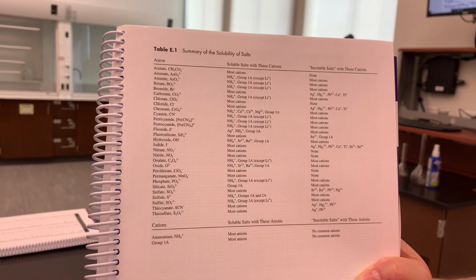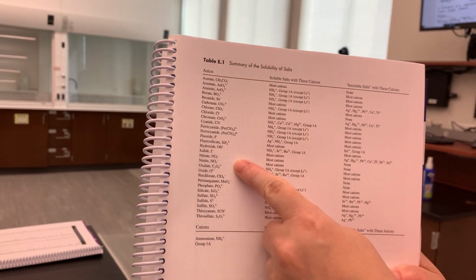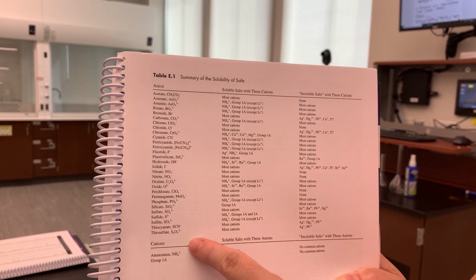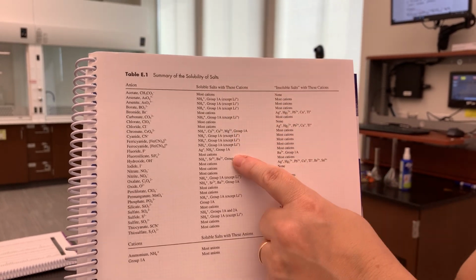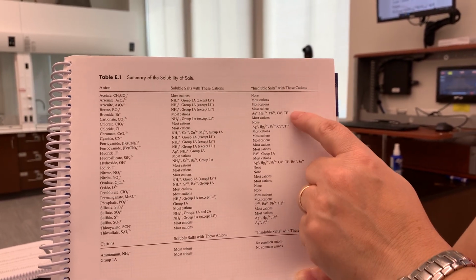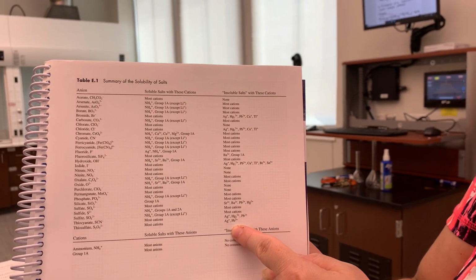So here you have, in the first column, anions or negatively charged ions listed in alphabetical order. You have a name, chemical formula, and the charge of each ion. And then the second column shows which salts are soluble with the cations from this column, and insoluble salts with certain cations for this anion are shown in the last and third column.